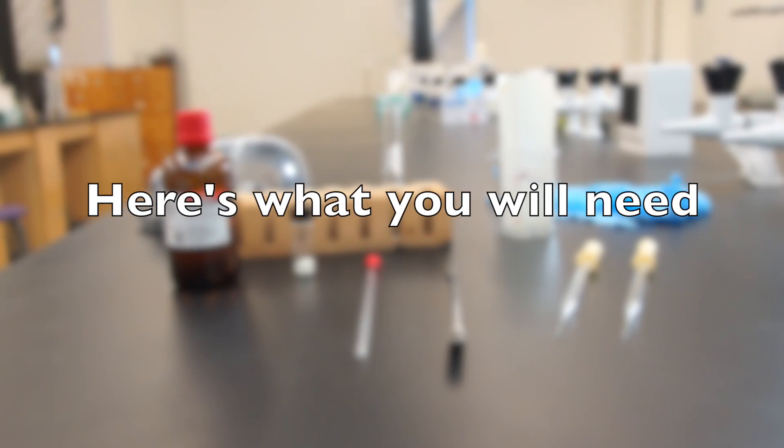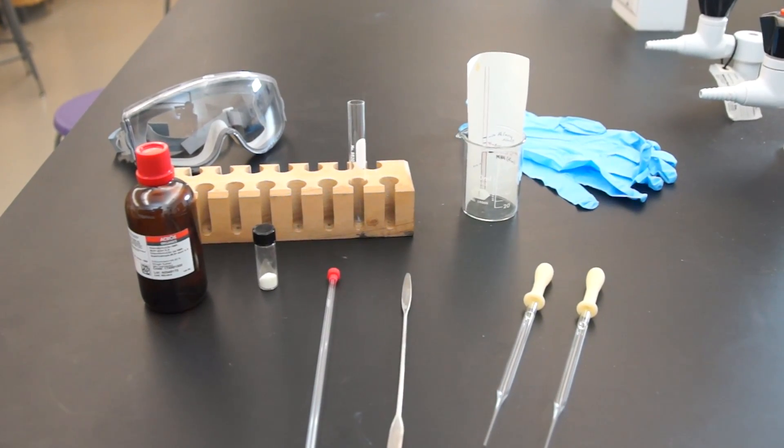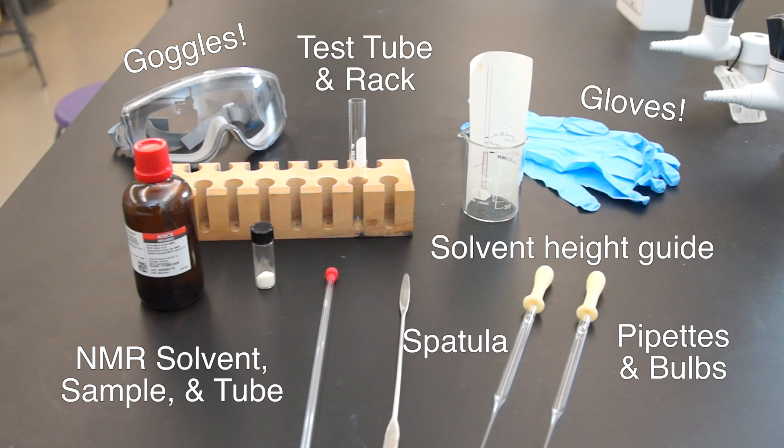To prepare your NMR sample, here's what you'll need: your test tube and rack, solvent height guide, NMR sample, solvent and tube, spatula, pipettes and bulbs. Also, always remember to have your goggles and your gloves.